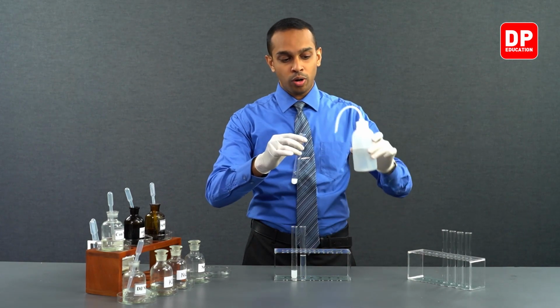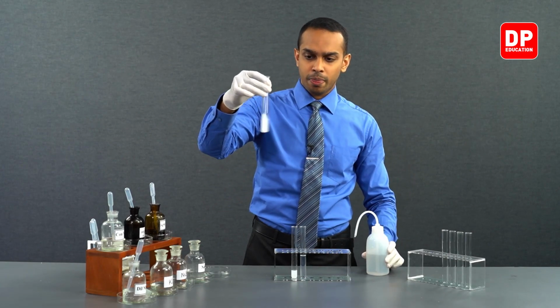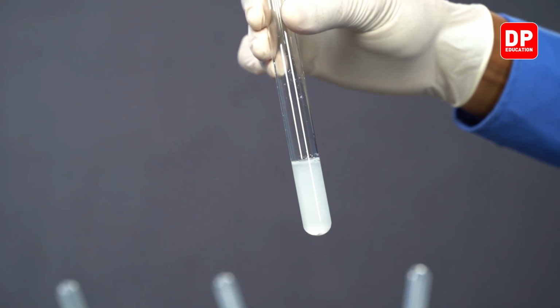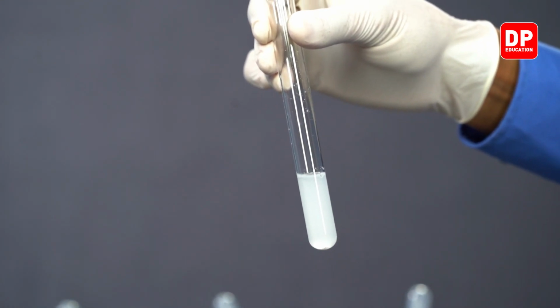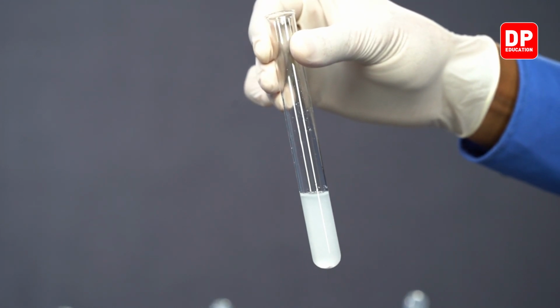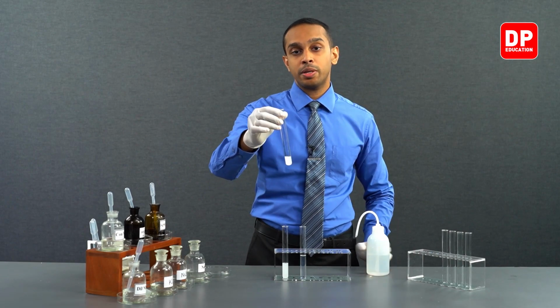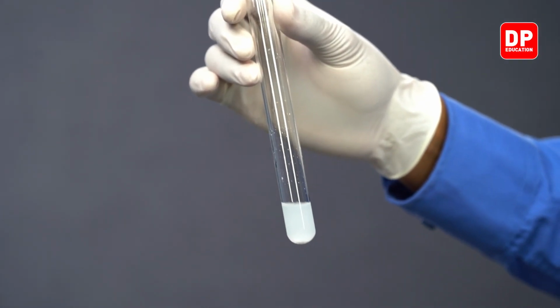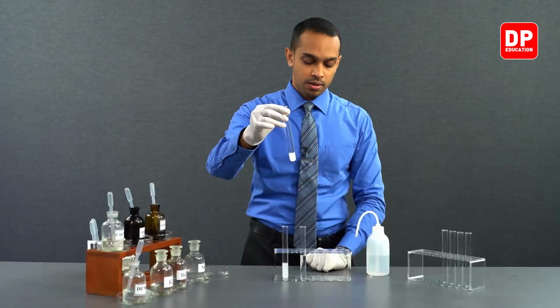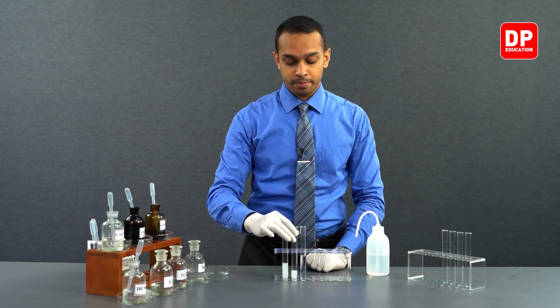We'll add a little bit more water to see the precipitate a little bit more clearly. You can see at the bottom of this test tube, there is silver chloride solid formed. And then we took a little bit of that silver chloride precipitate and reacted it with nitric acid. We did not observe any change. That is because nitric acid does not dissolve silver chloride.